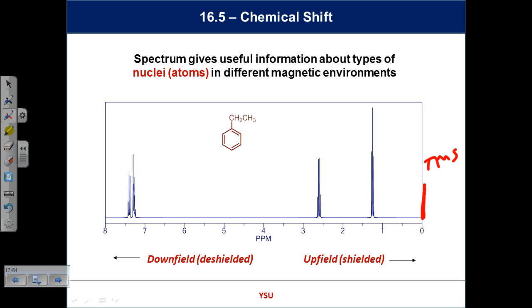It's a nice organic soluble material, so it dissolves in the solvents I showed you, and that's useful. So we would say that this signal is downfield of TMS. This signal is downfield of the one to the right, whereas this signal is upfield of this signal down here. As you get familiar with this, the spectroscopy sheet will become important again, because now we're talking about the top of that sheet, which is very much more complicated than the IR we did. Those chemical shifts are reliable. If you see signals down here, they are probably not simple alkyl groups. And if you see signals up here, it's probably not a benzene ring. So they have definite places they show up, and that becomes very useful for us to be able to analyze and use in problem solving.